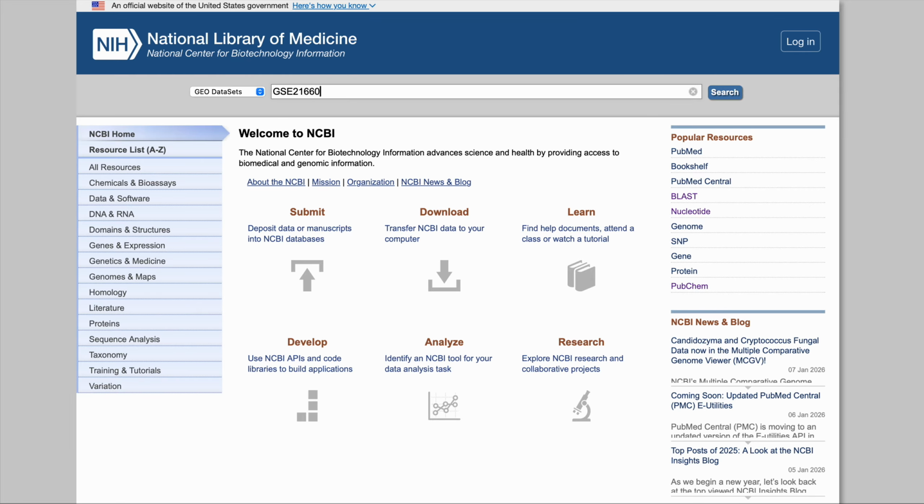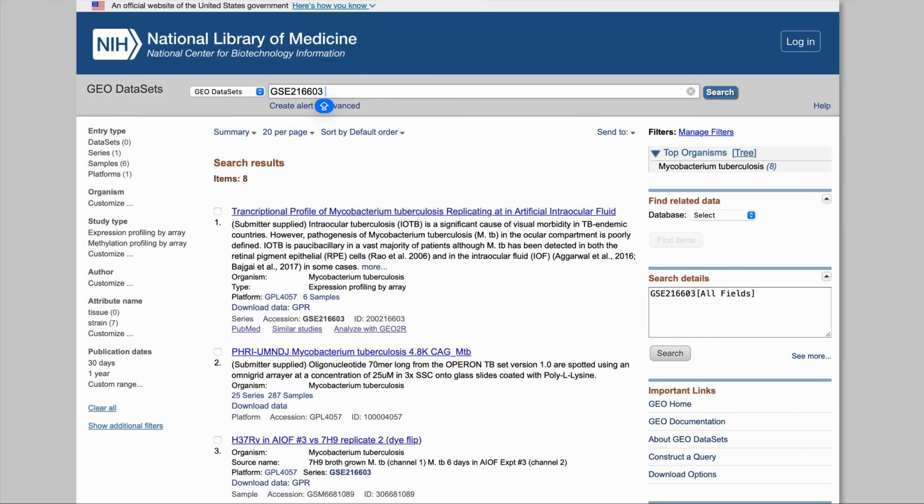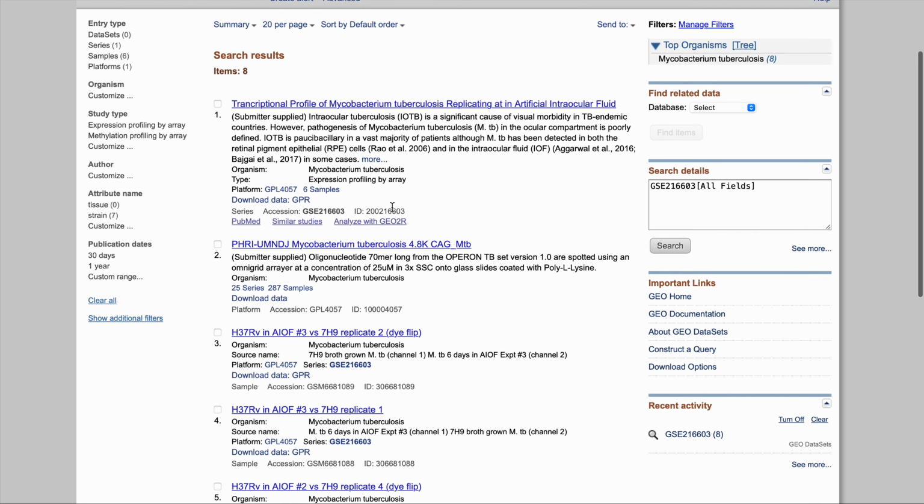So this is the ID. If I search via this, this is one way. Another way is, of course, by directly typing GEO in Google, and you will be redirected to the GEO page, and there also you can search. It is hosted by NCBI anyway, so it doesn't matter via which particular means you go, you'll land up at the same sort of results.